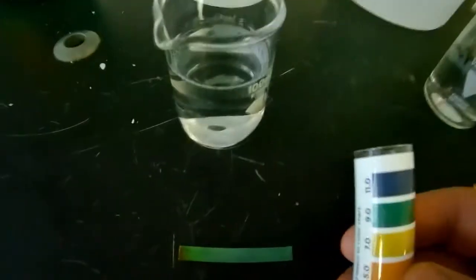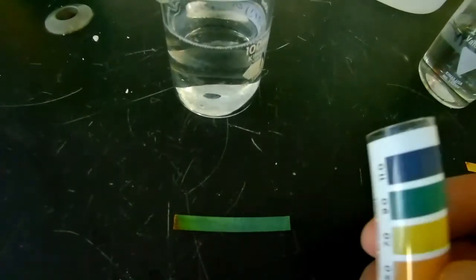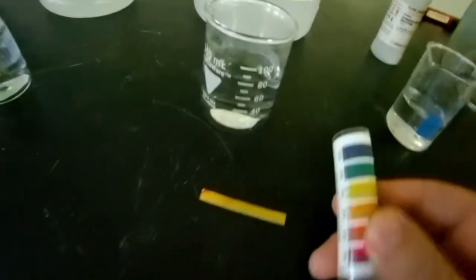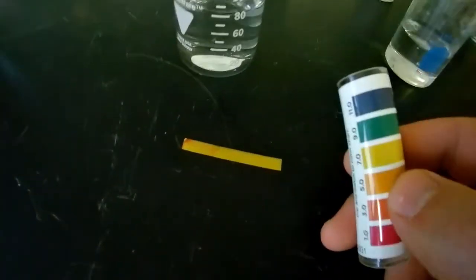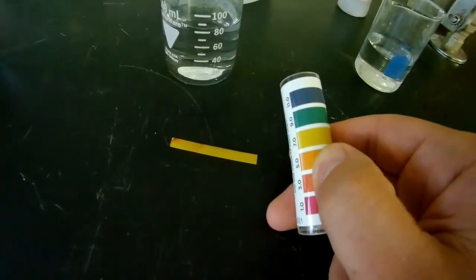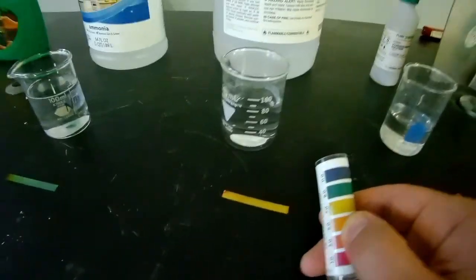Ammonia was our strongest base. We can see that the color is almost completely blue now, so that would make it a pretty strong base, an 11 or so on the scale. Our alcohol was a whole lot of nothing, so this just goes to show you that not everything is an acid or a base. This is around a 7. You can see it's about yellow, it didn't really change color, so that's pretty indicative that alcohol is neither an acid or a base. Not everything is an acid or a base, so that one just goes to show you.